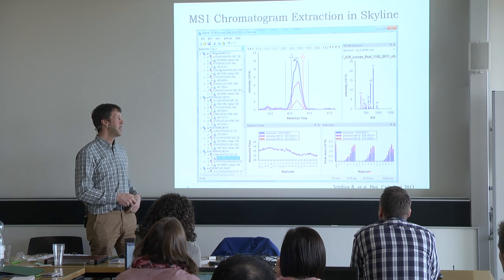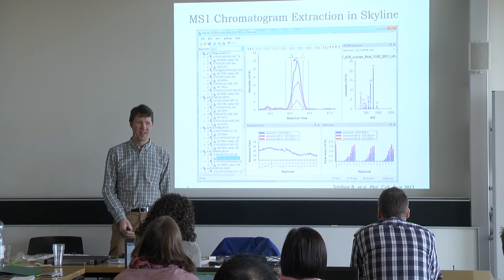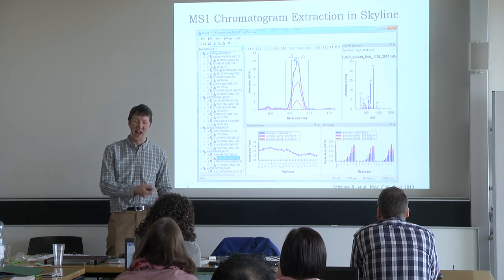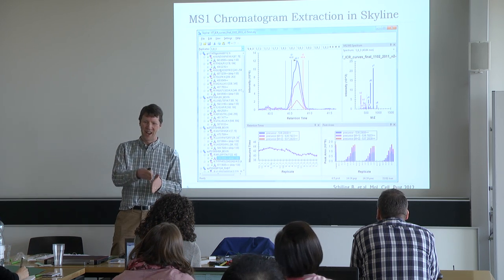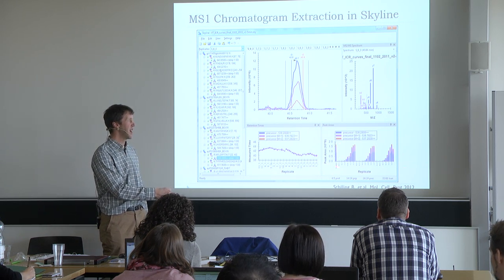DDA experiment. But so if you look at the peak areas, what were they doing? Calibration curve, yeah. We do a lot of these calibration curve experiments, and this is pretty telltale if you see every sample going up. And in this case, this is the acquired time order.